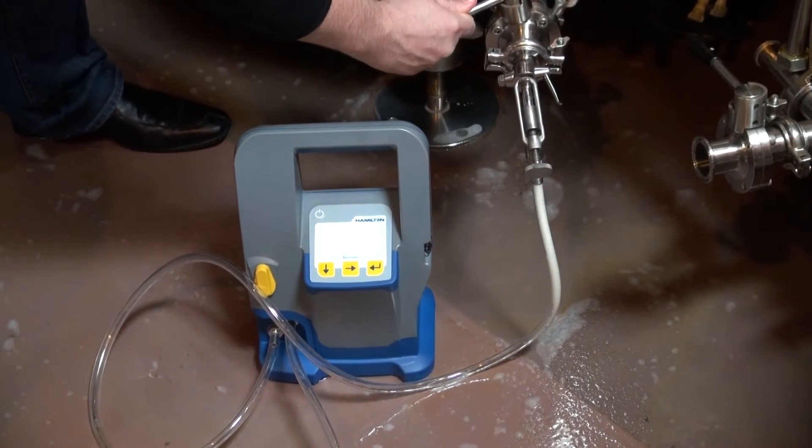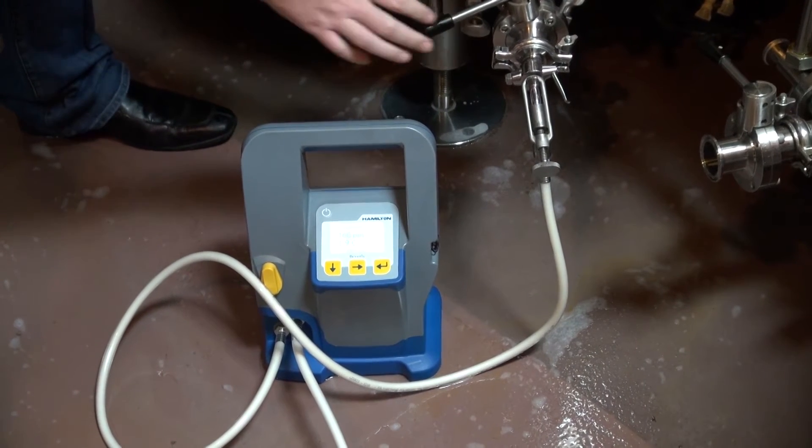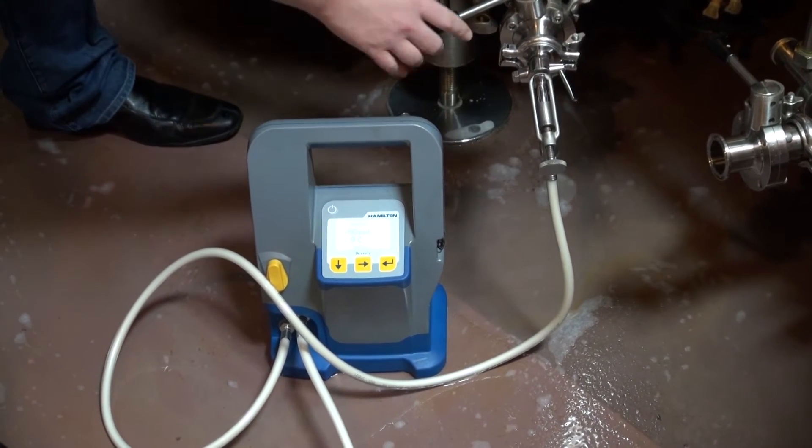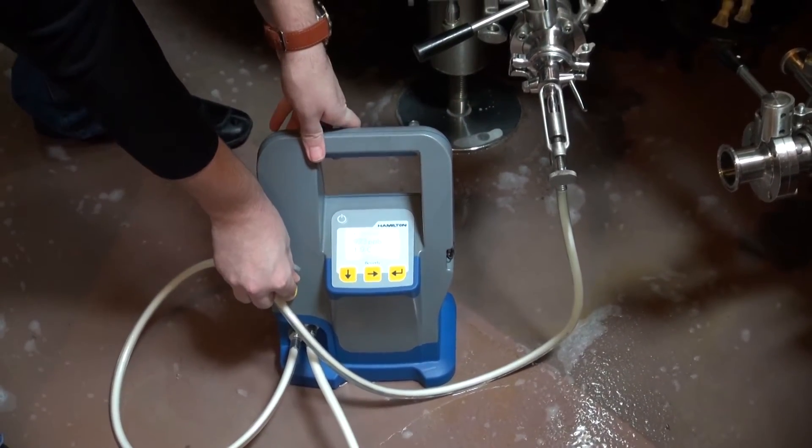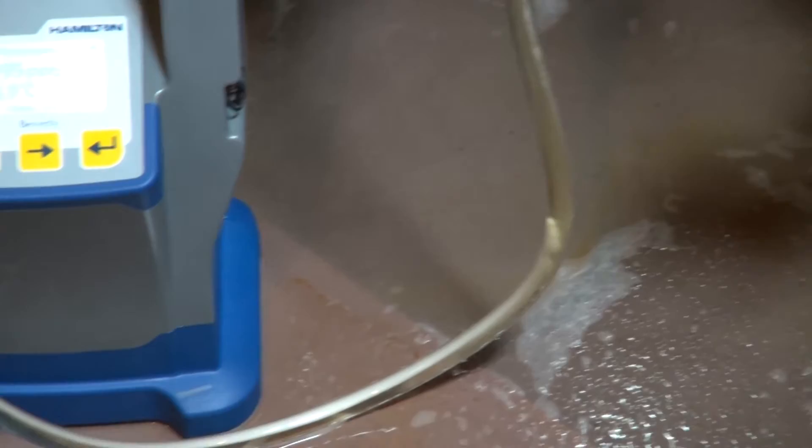Units are supplied complete with pre-installed sensor, wall or tank mount, hoses, and battery charger. The Beverly is compatible with common can and bottle piercers for testing dissolved oxygen in finished packages.